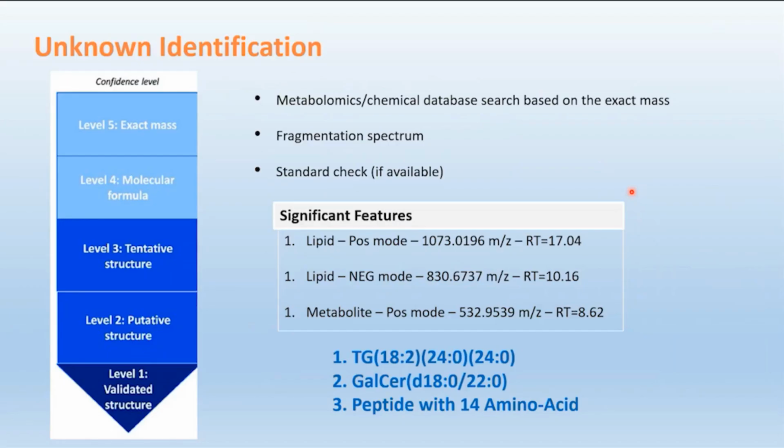And so this is really the complicated part of metabolomics, right? We think we can identify metabolites, but it's probably one of the more complex ways that we have in our world, trying to figure out how to identify true metabolites that are unknown, that we don't have any information about, right?